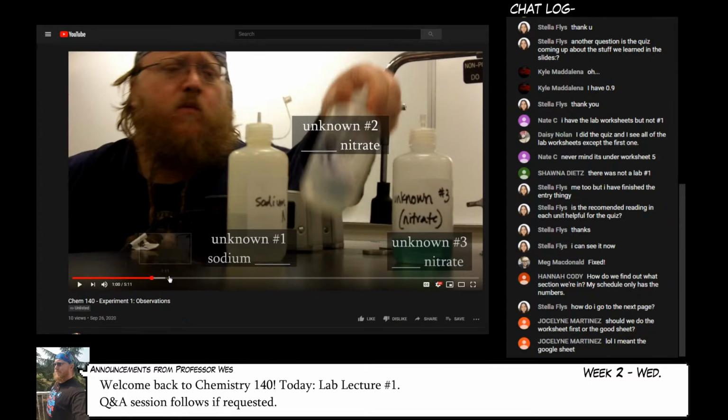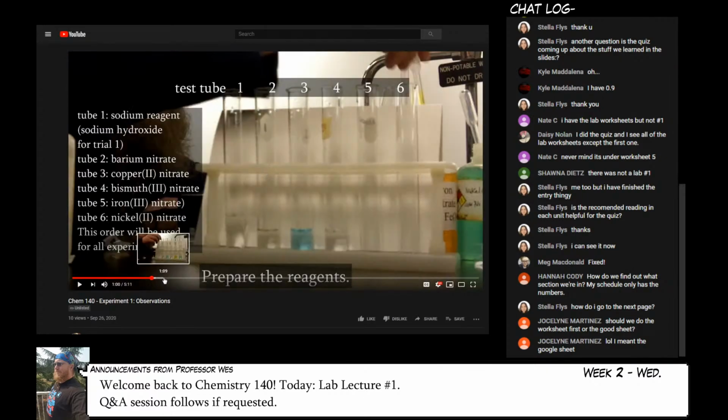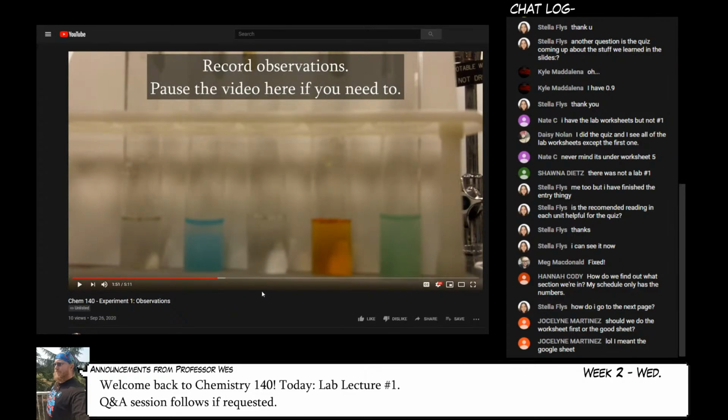And so I go through the process of mixing a bunch of known chemicals together, and then I ask you to record the observations. I wish the video quality was better. Unfortunately, I realized after reviewing the footage, after 3 hours of recording this, that it didn't autofocus. You can see that the faucet in the background is extremely clear. The stuff that I care about, not so much. So do the best that you can, and I have some suggestions for that in the worksheet.